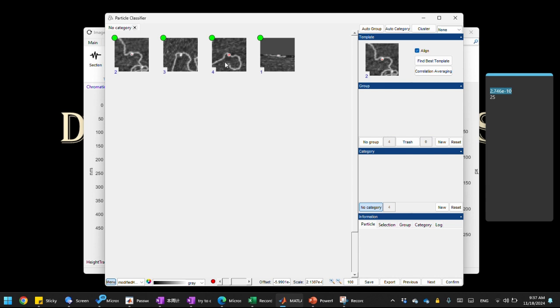That's one limitation here. And now the parameters that are shown in this table are for the masks. So it's just this tiny little box. So they're not very useful, right? This is only useful for doing the correlation, but not for analyzing other things, like getting information from the parameters of the particles. So that's the limitation of using a custom sized box as input to the particle classifier.